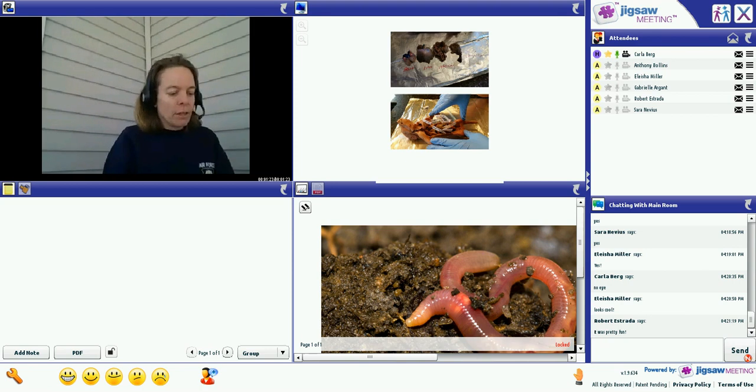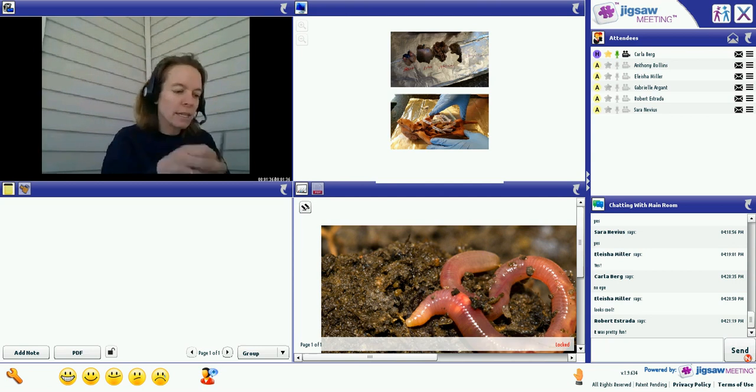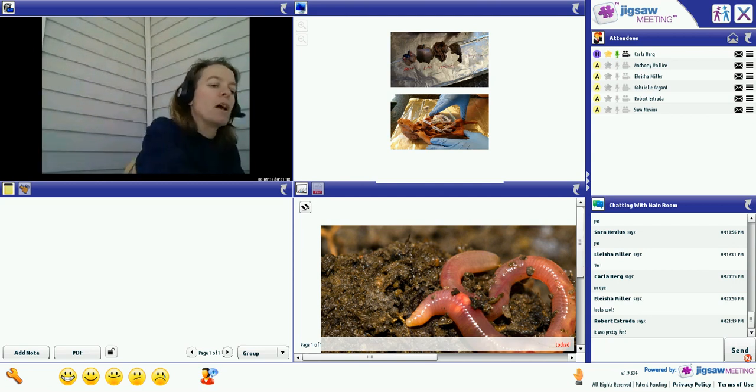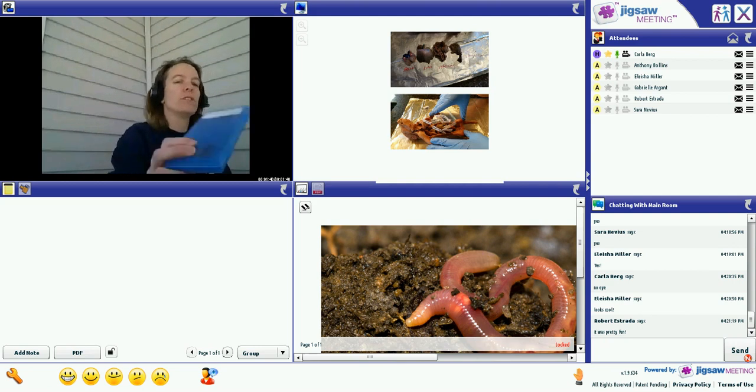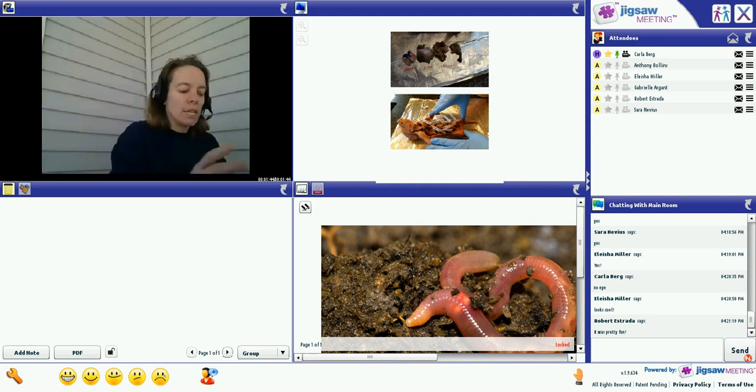A couple of safety features. When you are dissecting, you are using sharp instruments. I tend to like to use scissors while I am dissecting. I find it much easier than using a scalpel. It is completely up to you. All of your tools you will need for dissecting are in this little blue kit. And we will go over each in a second.